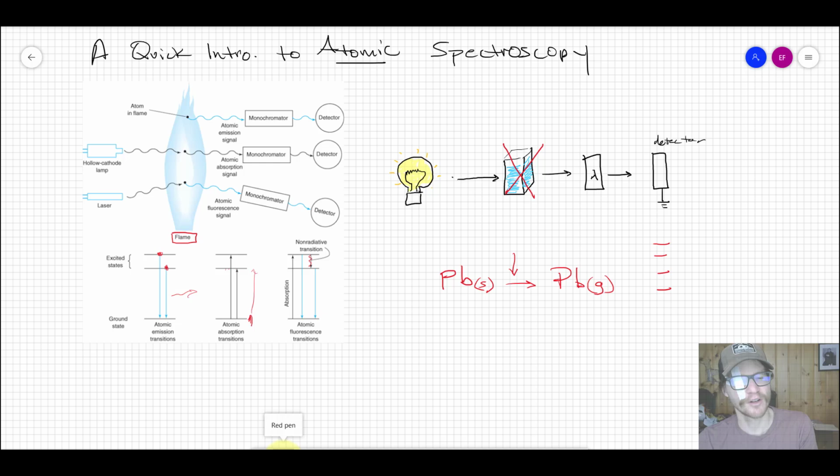What you have left are all the solids, or in this case ions, that come together rapidly, and those ions can then break apart, and you're left with the ion or the metal, depending on what state it's in, and that then sublimes to the gaseous state, or we call that atomization.